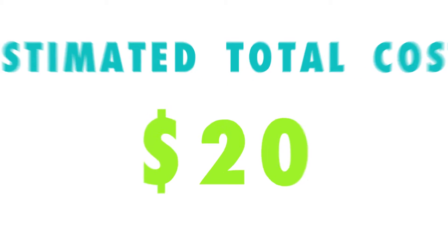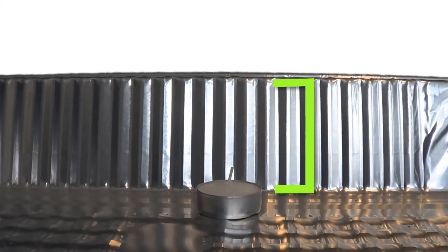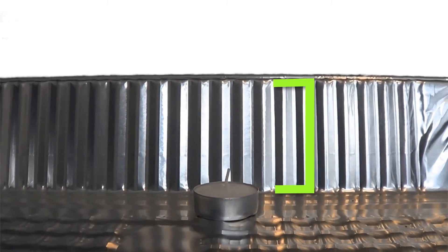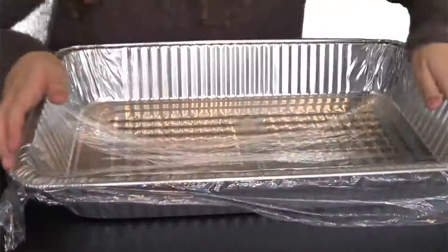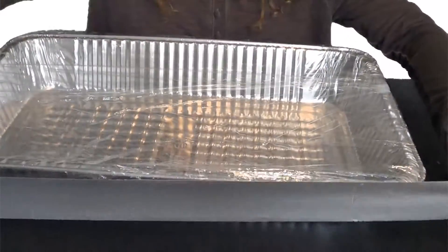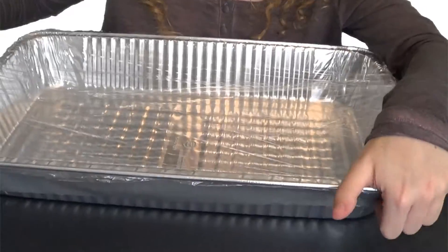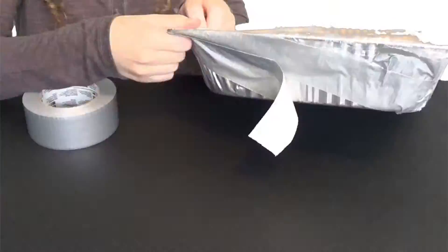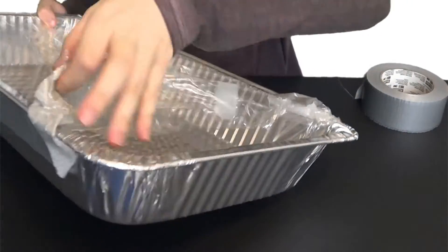Now that you've gathered all the materials, set down your aluminum pan on a flat surface. Place your candle inside to make sure that there's a sufficient gap between the top of the pan and the wick of the candle. Then take the plastic wrap and stretch it across the pan, making sure it goes over the edges so that there is enough room to tape it all down. Cut off the required length of plastic wrap and apply duct tape as necessary so that it is sealed down tightly. That being said, you want to make it so that the duct tape is able to be removed later on, so you can place the candle and your experiment inside.